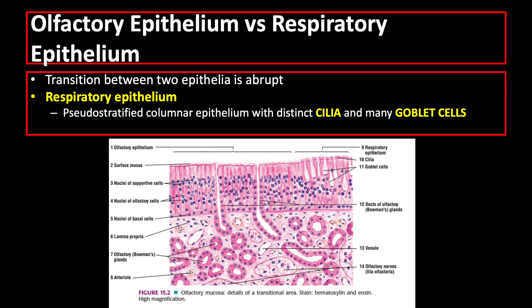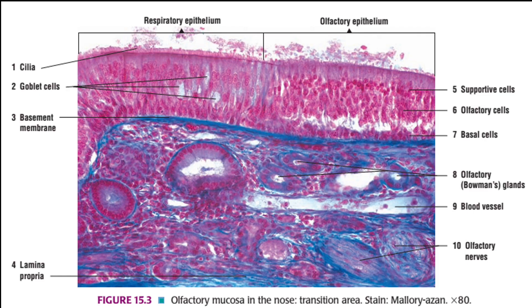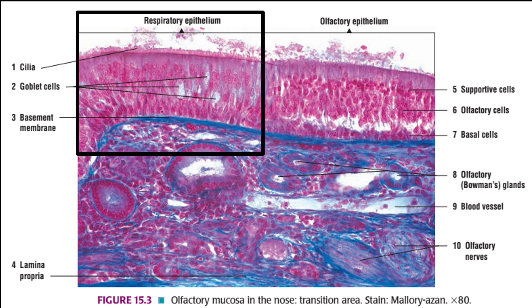In this slide, you can see the abrupt transition between the two epithelium types. The respiratory epithelium is lined by pseudostratified columnar epithelium with distinct cilia and many goblet cells, while the olfactory epithelium does not contain goblet cells and cilia, but you can find Bowman's glands at the lamina propria.